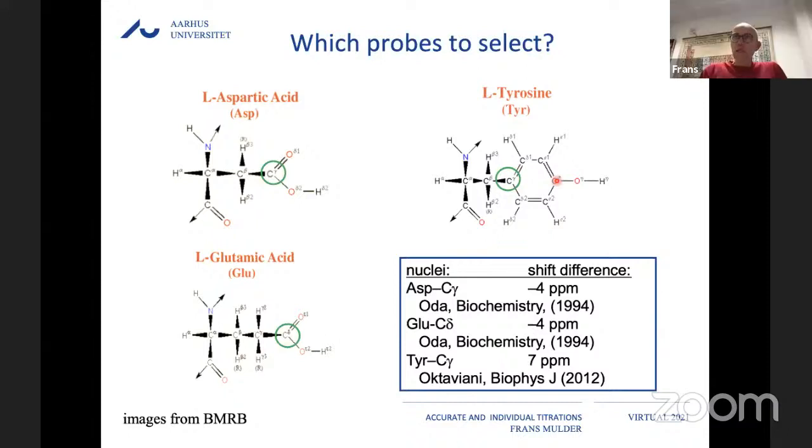In that case, if you are also interested in following the conformational states of side chains during titrations, I would suggest coupling that with the use of residual dipolar couplings. Originally NMR structures have been determined mainly by NOE-based methods, and those structures are still not very high precision.